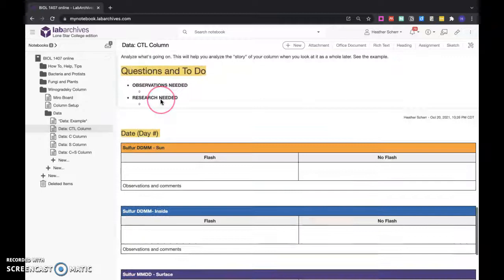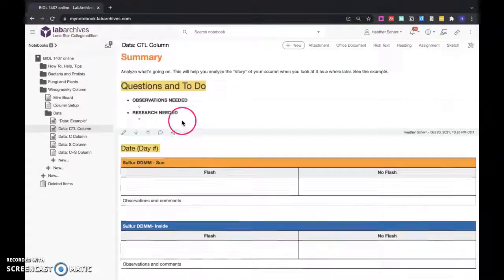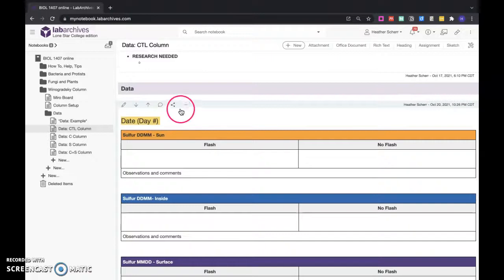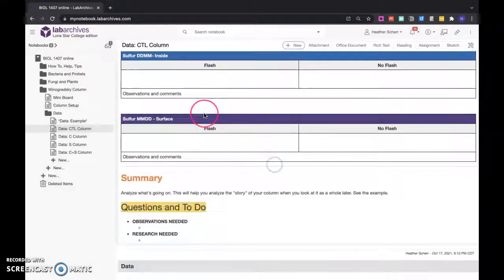That's another empty copy, so you can see now I have 2. So this would be day 0 and this would be day 5 or whatever. I guess we'll do it on, like I said, Tuesdays and Saturdays. Anyway, so let me delete these so that they don't mess up your pages, become weird. Okay.